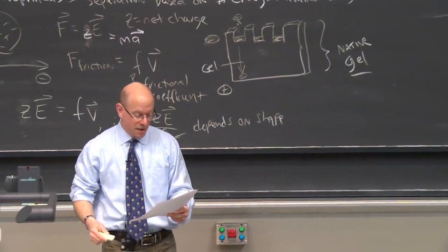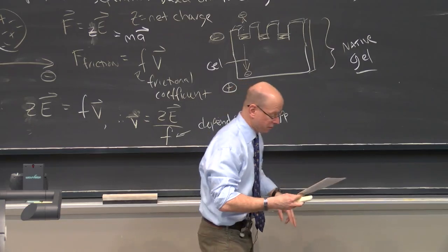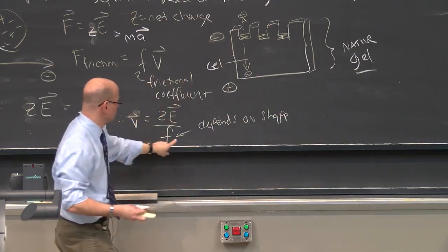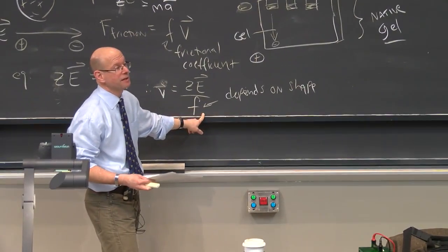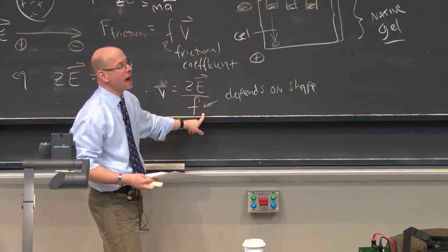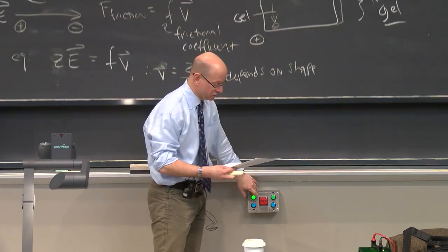And clearly, if I do a native gel, I'm going to end up with two problems. Proteins moving in opposite directions, and proteins whose movement depends on the shape of the protein. Doesn't mean it's a bad technique. People do this technique. It's sometimes useful. But it's not going to be helpful for what we want to talk about, which is purifying proteins from scratch.